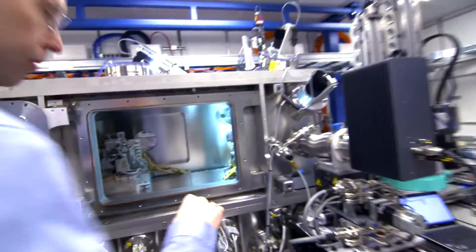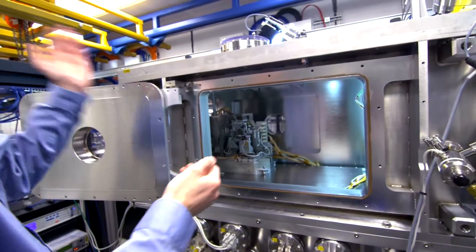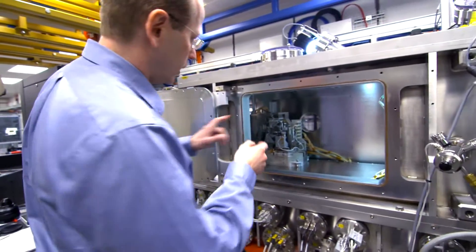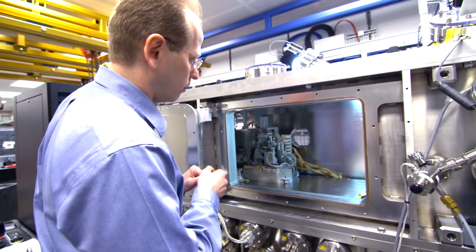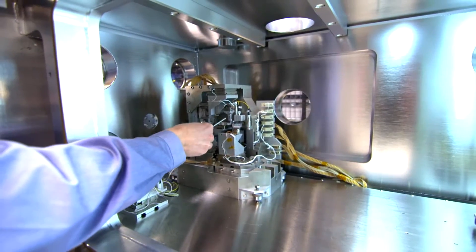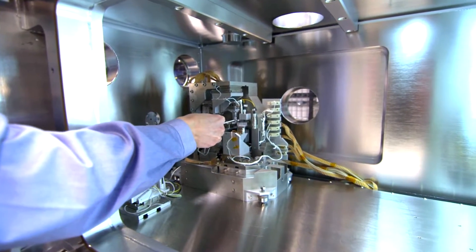Then the beam comes this way and hits the sample. And this is the MLL module of the microscope. This is the sample area, so we mount the sample right here.